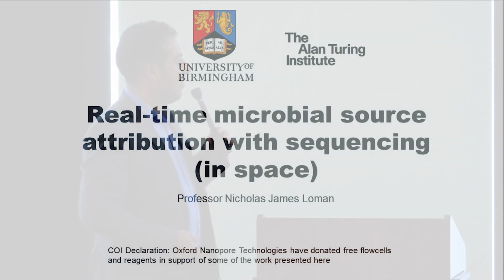So I'm going to talk about source attribution with sequencing and strain tracking, and try and refer this to space if I can. I'm not a massive space nerd, but I think it's so exciting when you come here and you look around and get really excited about the prospects of deep space travel. Although I don't really fancy it myself in that little Orion thing, whatever.